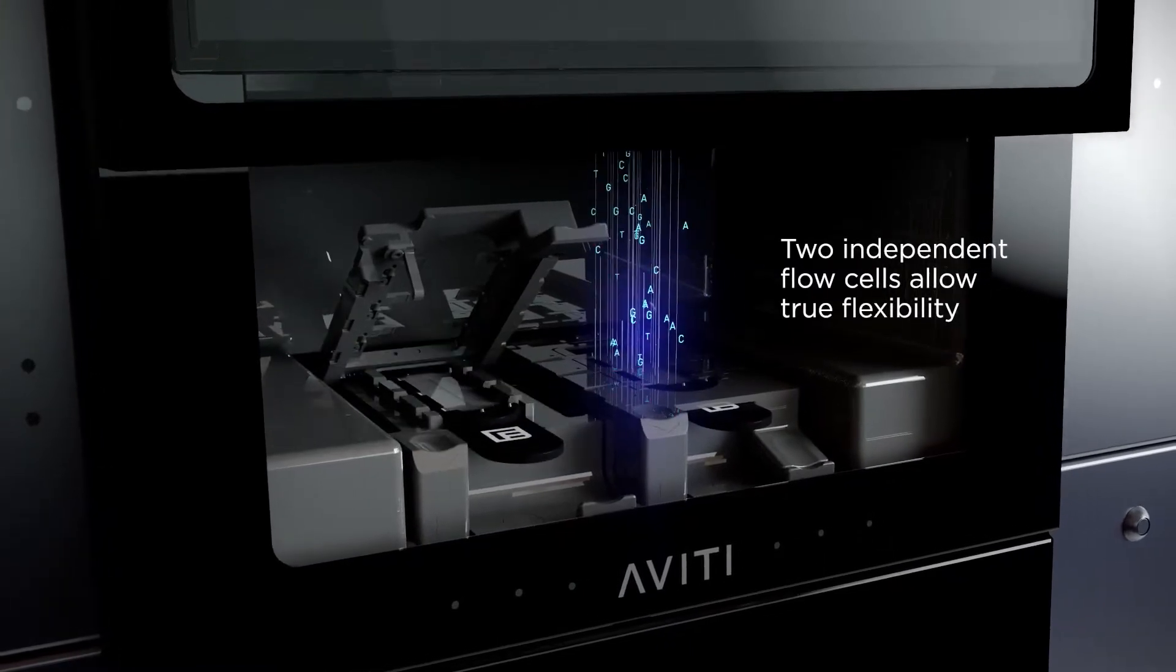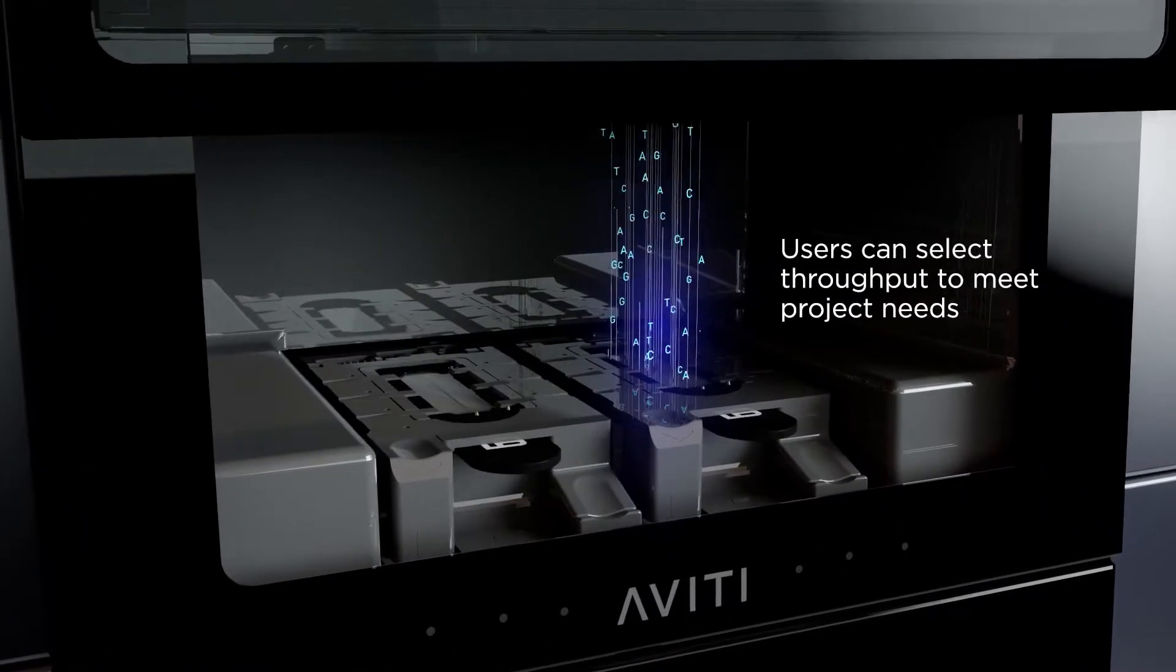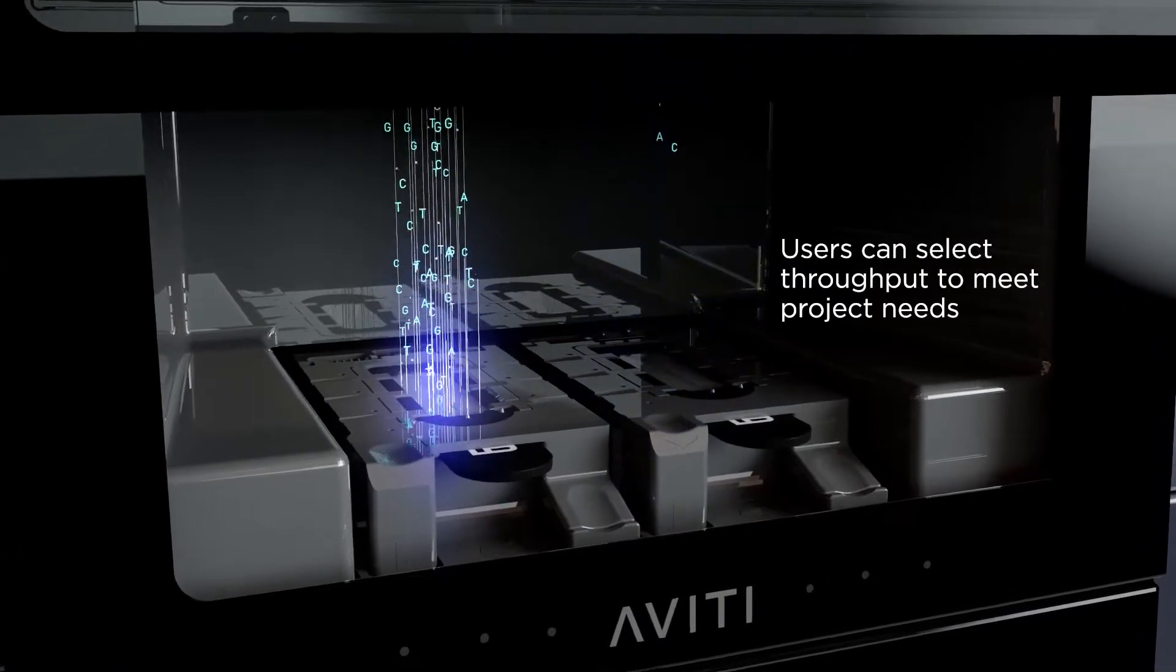With our independent dual flow cell random access format, you can perform multiple experiments concurrently or independently.